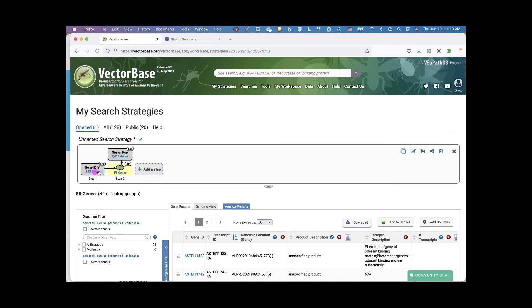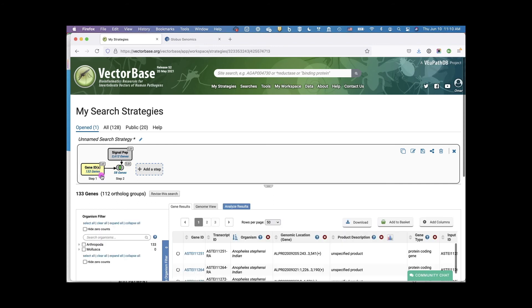Going back to my first step of 133 genes, another way of exploring this data is to examine enrichment. As long as you have terms in your gene list that you can enrich on, you can do an enrichment analysis in different ways. This functionality within VectorBase allows you to continue exploring your differentially expressed genes through built-in tools.